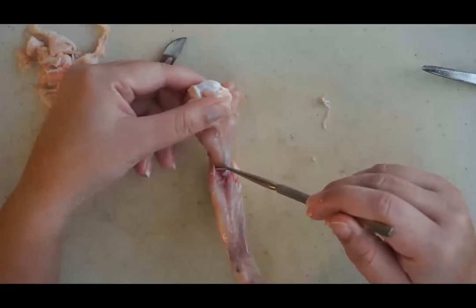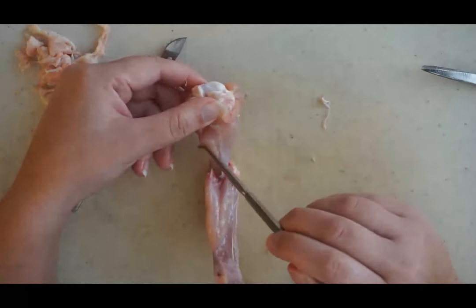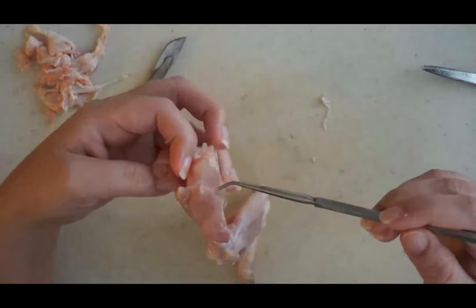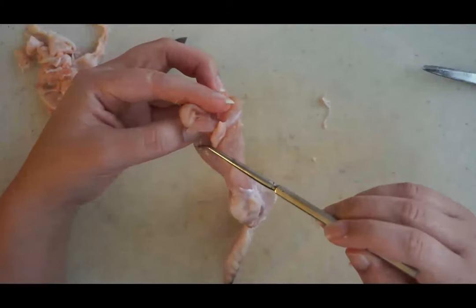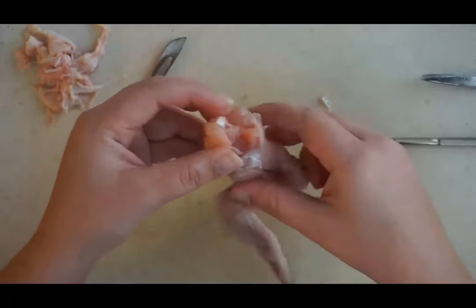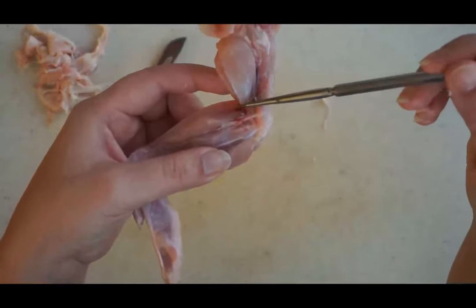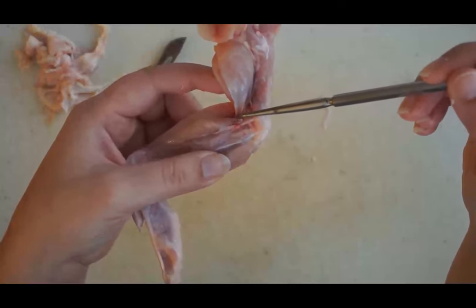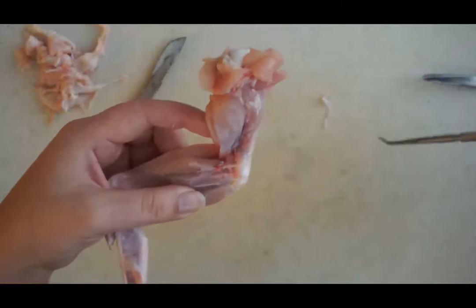Let's take a look at the bicep muscle — you can see why it's called a bicep: it has two different muscles right there. And then if we look at the tricep, as you might expect, there are three different muscle groups for the tricep, giving it its name. If you look at the end of the bicep, at the insertion of the bicep, you can see a silvery white layer, and that is the tendon that is attaching the bicep to the radius bone.